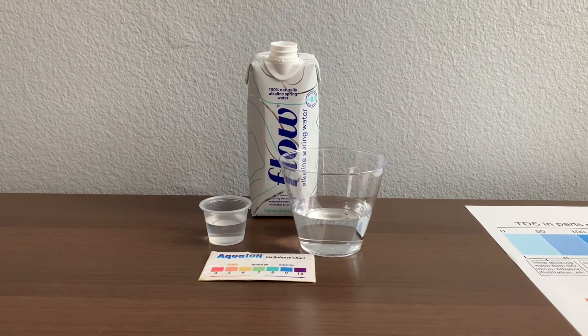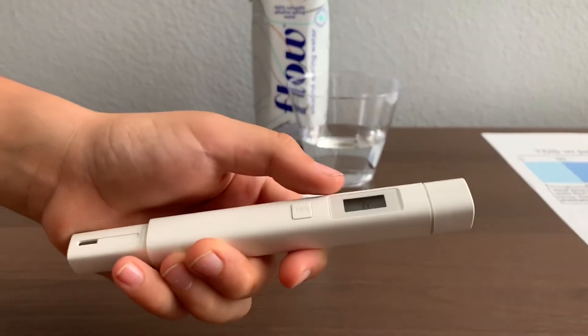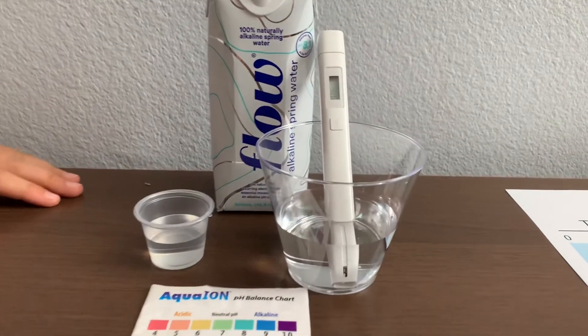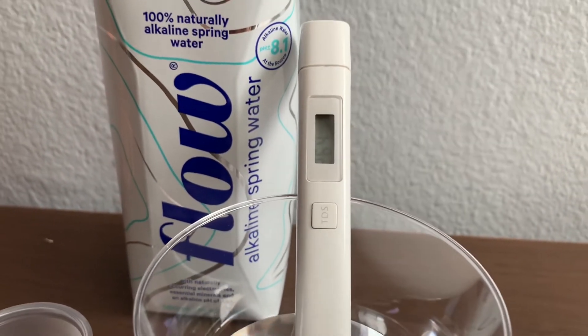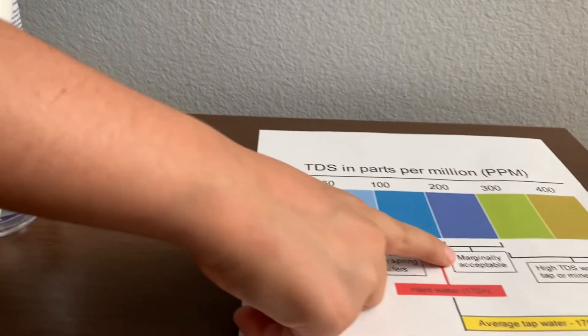First, let's test the TDS level. Turn on the TDS tester, make sure it says zero, and put it in. 264 — that is marginally acceptable.